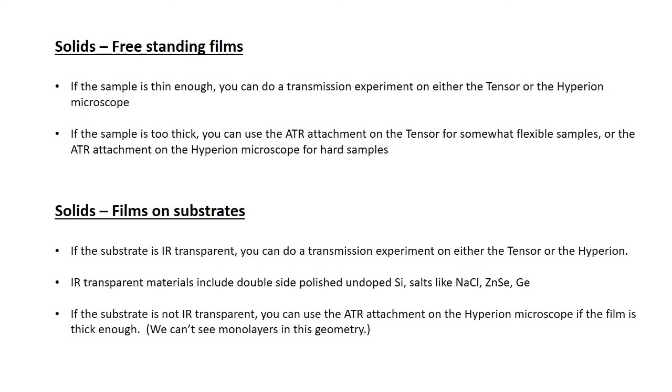So I hope you've learned a little bit about the system in general, how infrared spectroscopy works, and maybe are starting to have some ideas of what geometries you may run your samples on our system. If you have additional questions, feel free to contact me to discuss your particular samples in more detail, and we can identify a geometry that is going to work for you.